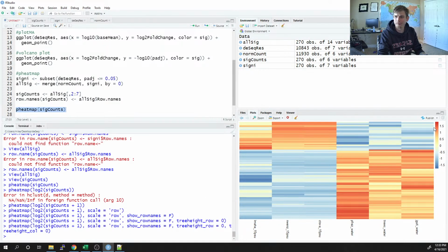So now all we have is this z-score. It's really a z-score, and the z-score basically tells us where in the distribution this data point falls, and we use the standard deviation to reflect that, right?